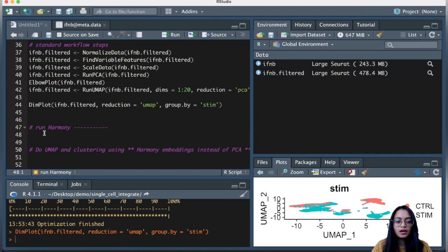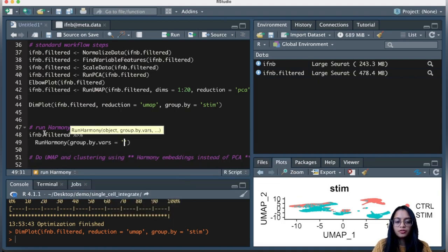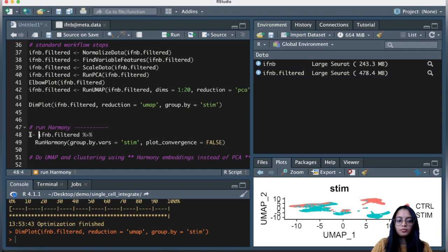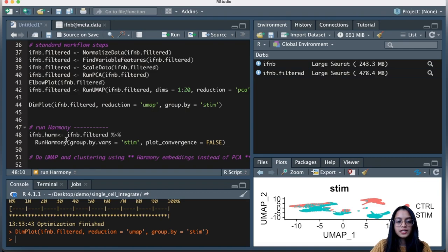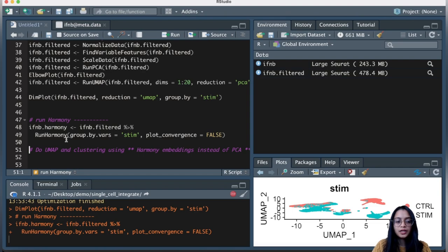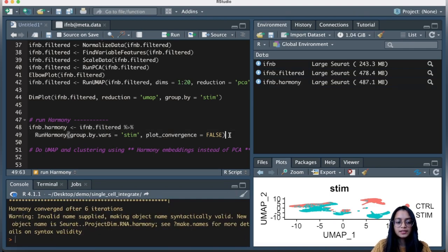We will run Harmony using the RunHarmony wrapper function, which takes the Seurat object as input. Within RunHarmony, we define the group.by.vars parameter — the variable by which to integrate the data. In this case it's condition, stored in the 'stim' column. I'll set plot_convergence to FALSE and assign the output to a new object called ifnb_harmony. This command returns the corrected dimensionality values, called embeddings.